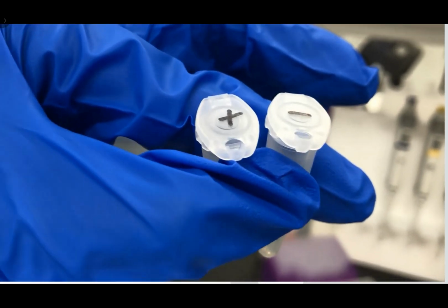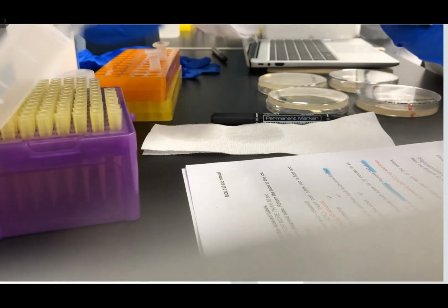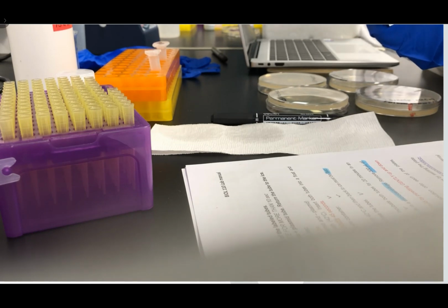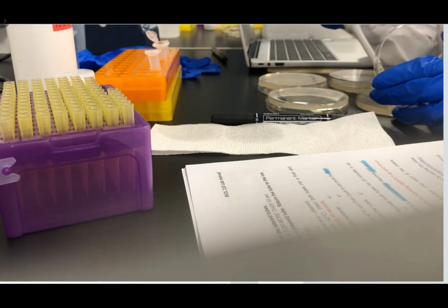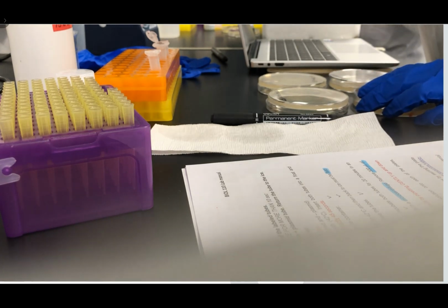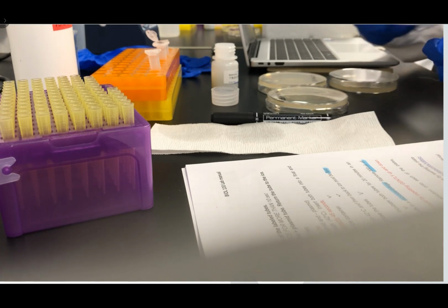So now I have done the microcentrifuge and I'm going to remove the supernatant. The microcentrifuging is important because it can increase the concentration of cells. Here I'm going to plate the cell solution onto the plates. Glass beads are used to make sure that the cell solution is evenly distributed.